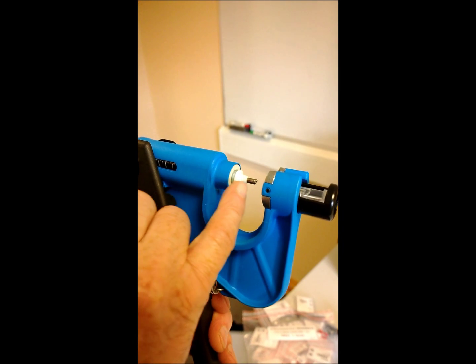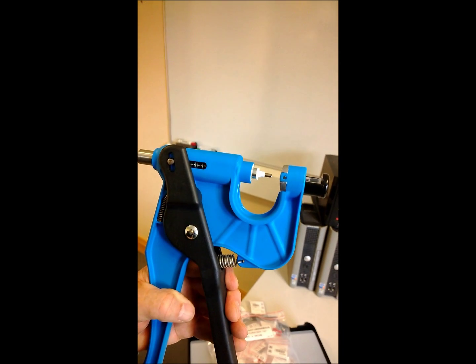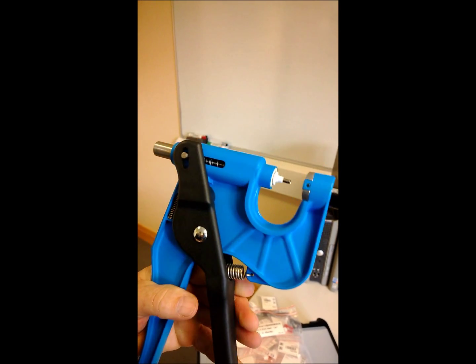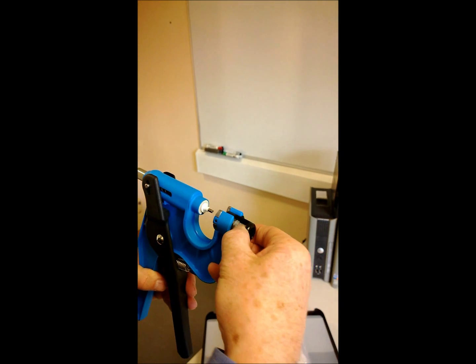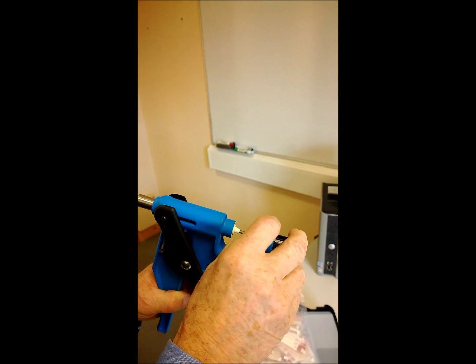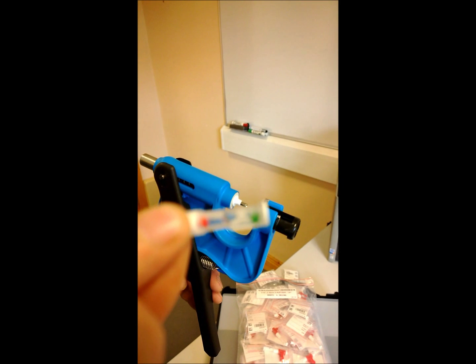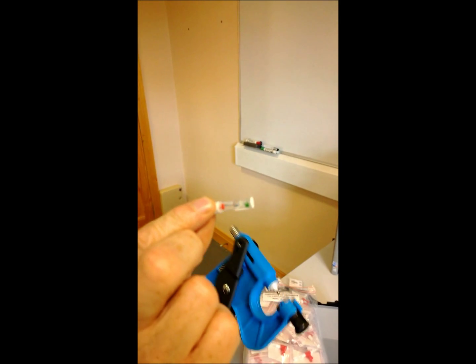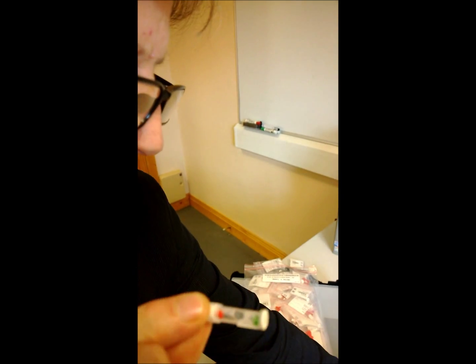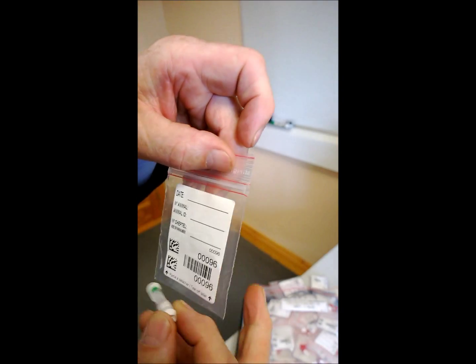Simply place the ear of the animal between the needle and the tube and press the handle. We now have the sample. Open the black handle and remove the tube. The tube will then contain the sample of tissue. We then retain the individual bag and we're ready to send it to the laboratory.